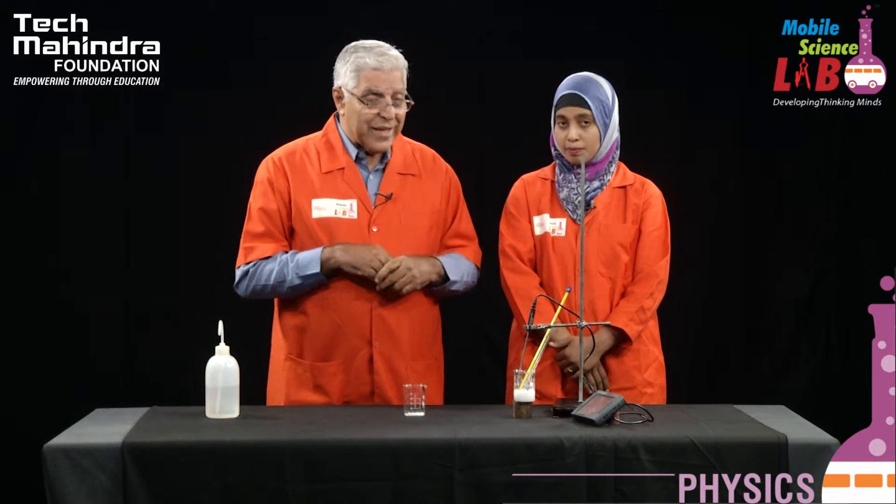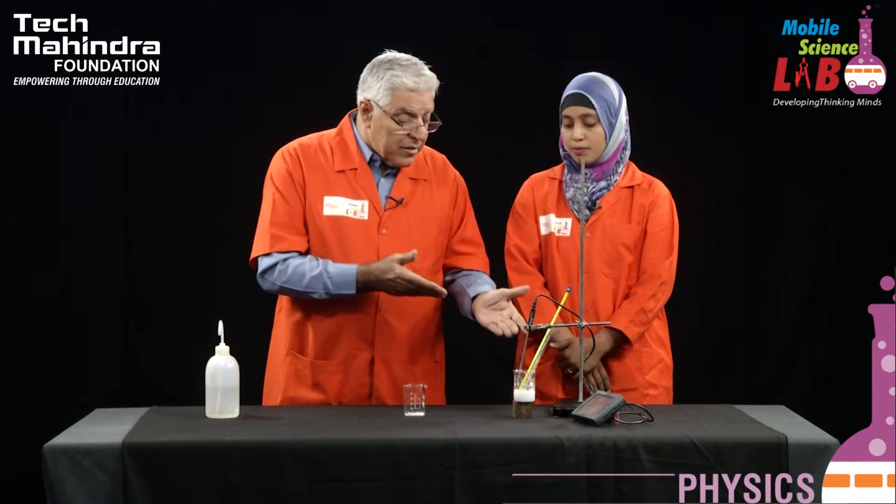We have a reaction in which the temperature has gone down. This is also a reaction in which there is a basic chemical reaction called double displacement — a double displacement reaction. So students, you understand one simple experiment can teach you so much of chemistry.